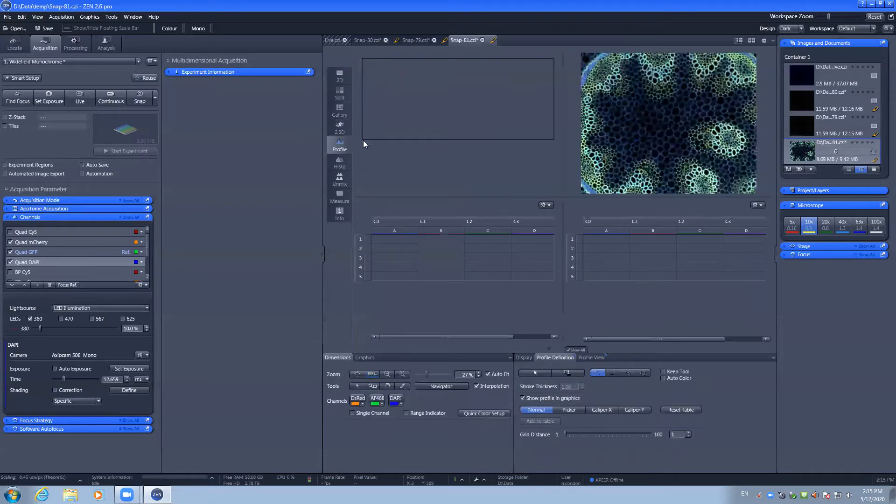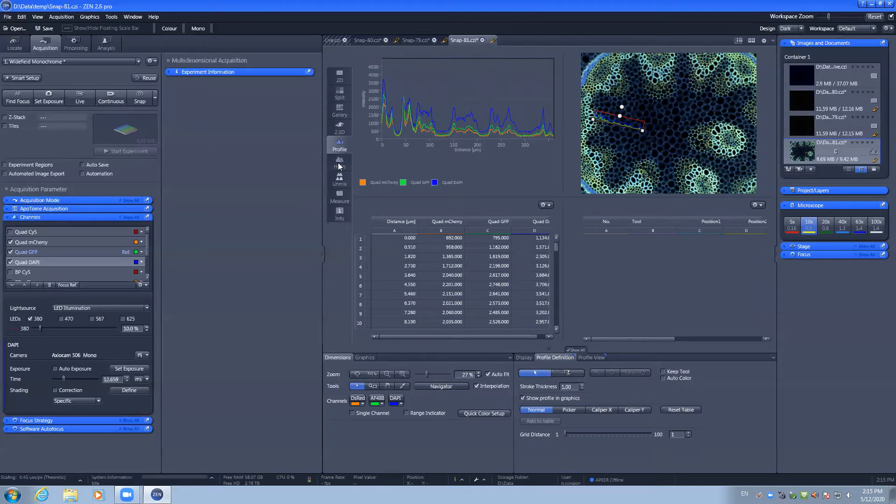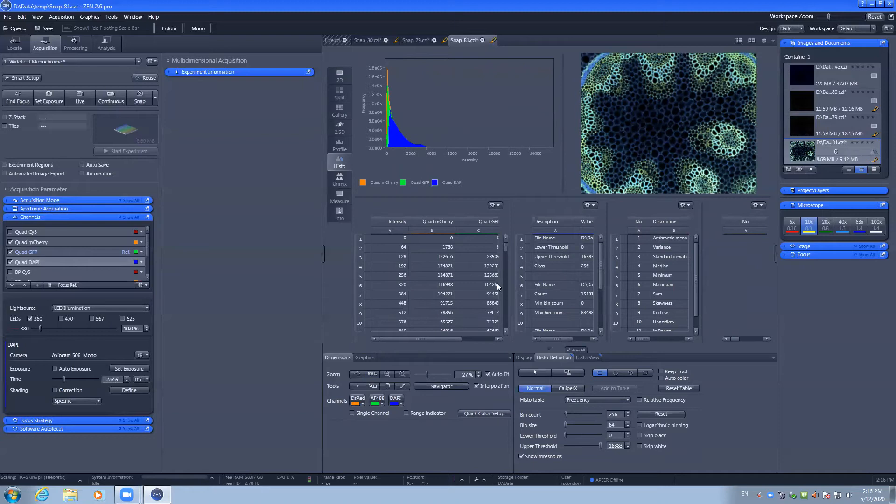The profile tool lets you click and drag a line scan across an image to look for co-localization. The histogram will show you the histogram of your image as well as the raw values as well as some statistics on those.